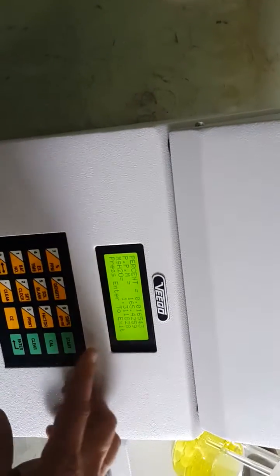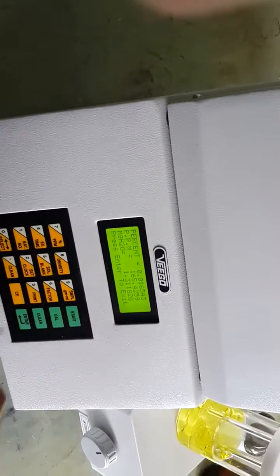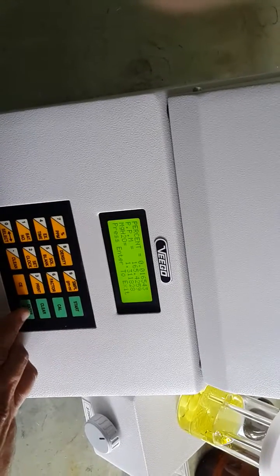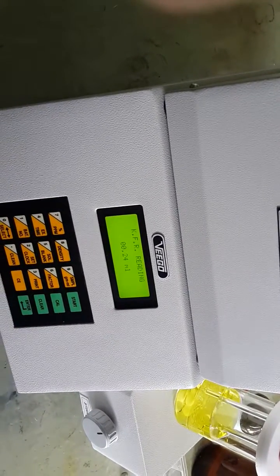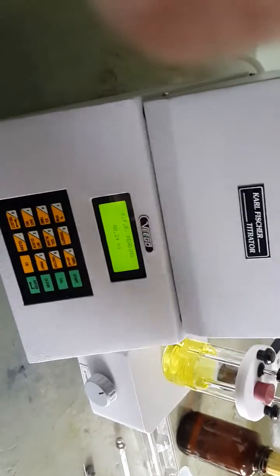This is the result on a weight-by-weight basis because we entered the density. Note down the result and press the enter key. The titrator is now ready to add the next sample.